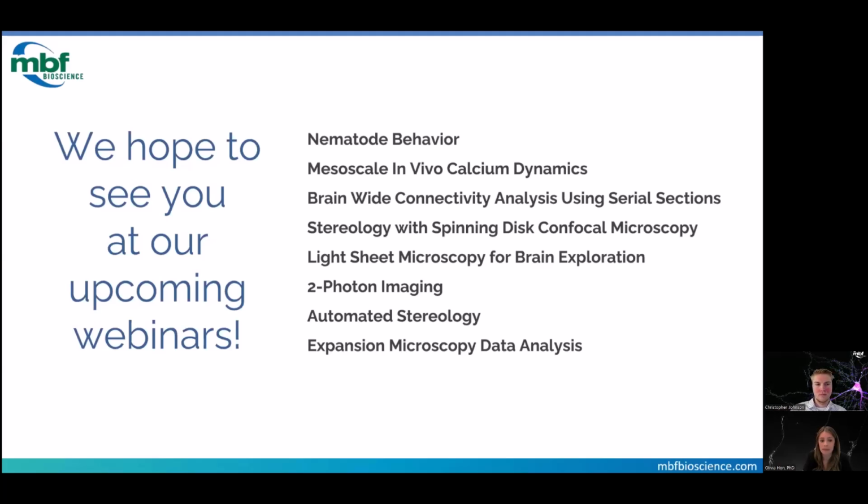So another question, is it possible to detect sensor activity in one region and opto-stimulate in another region if you're doing multi-site recording? Are you confined to only stimulating the region you're recording from? Yeah, that's a great question. You can stimulate in a different region. It just depends on where you focus your laser. So if you're recording from one ROI and then you focus your laser down a different patch cord branch, then you could do stimulation in another region that way.